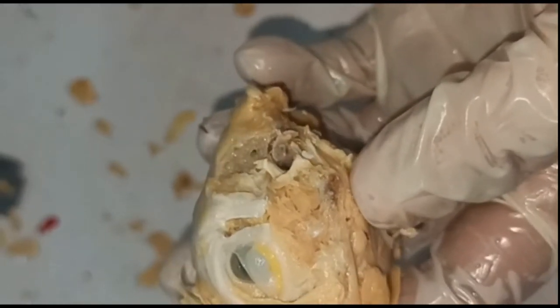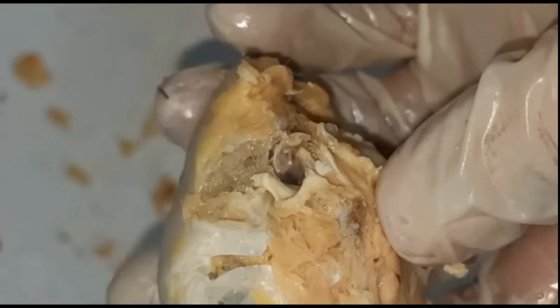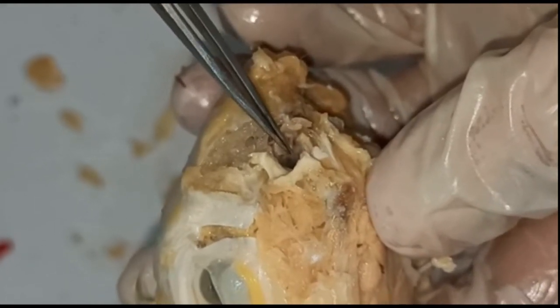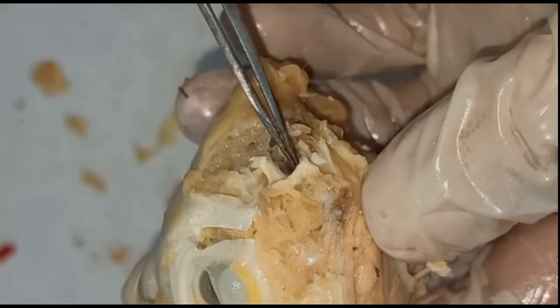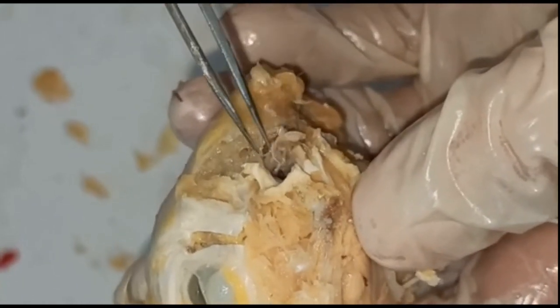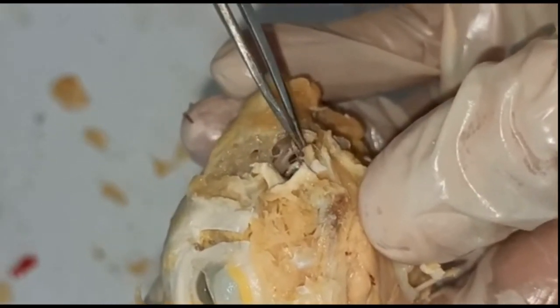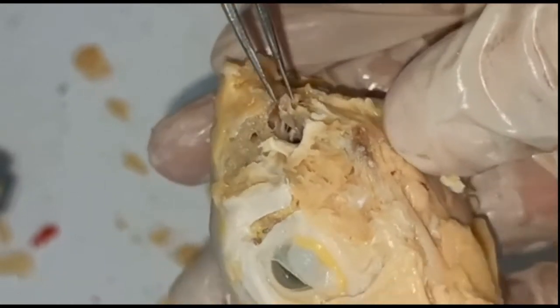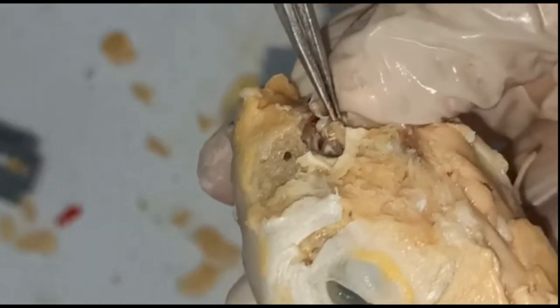When we locate it very clearly, in the next step of mounting we have to tear the tympanum from one side and hold it up so as to locate the fenestra ovalis behind it. So here when we tear the tympanum and hold it up we can see the opening of the internal ear, that is the fenestra ovalis. And from this opening, this fine rod-like structure is the columella.